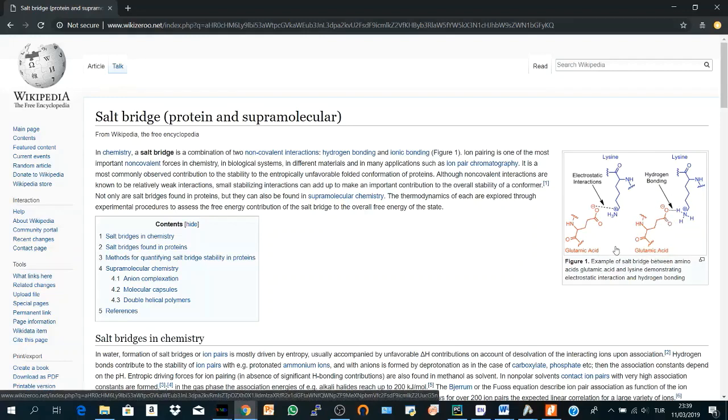the hydrogen bonding between a hydrogen of a positive amino acid and an oxygen or nitrogen of a negative amino acid.